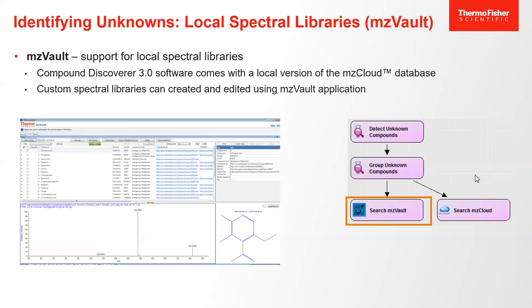Wei Zhu and a few of his students, and Yan, who went back to China, right? Yes. First of all, spent a lot of time getting those chemicals into solution, okay? I don't want that to sound simplistic. When you have 600 different powders, you get them all into solution successfully, that's a major step forward, okay? Then they ship them to me, and one at a time, I ran each compound on the mass spectrometer singly.